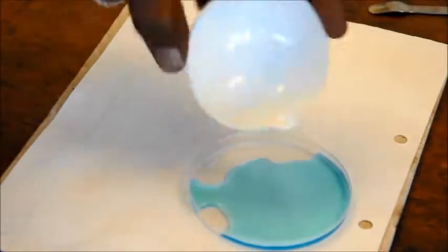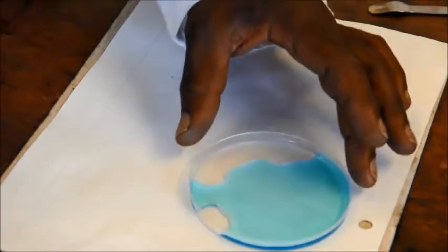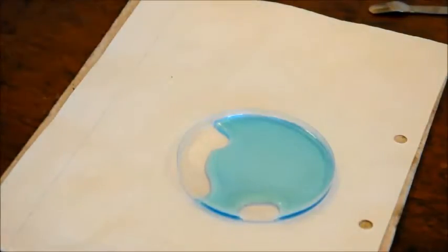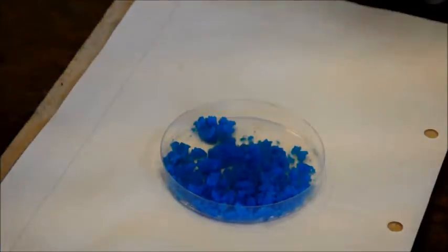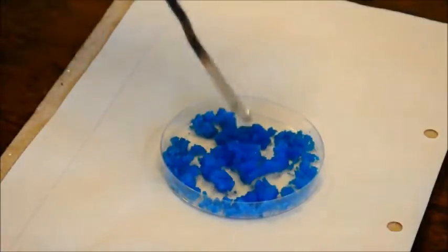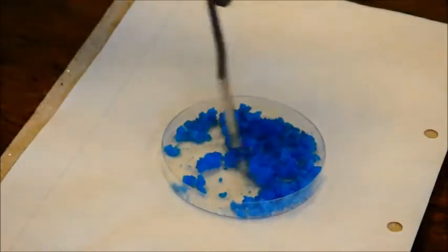We can leave it somewhere warm, doesn't have to be by the window, and over time the rest of the water will evaporate, and what we'll be left with will be copper sulfate crystals. That's it. And finally, this is what it's about. These are the actual copper sulfate crystals, and it's a simple matter of leaving them for the rest of the water to evaporate, and you're left with solid, blue, hard, dry copper sulfate crystals.